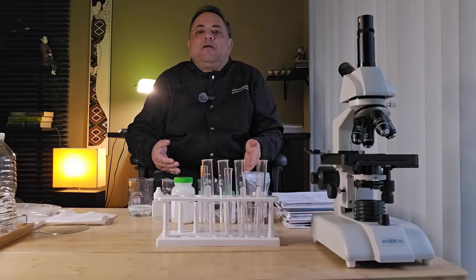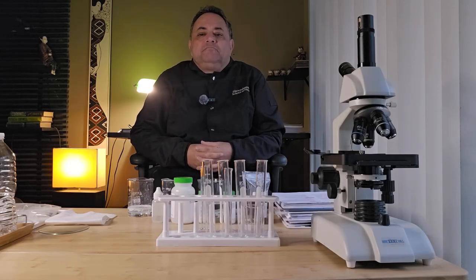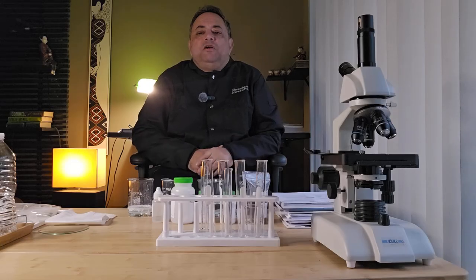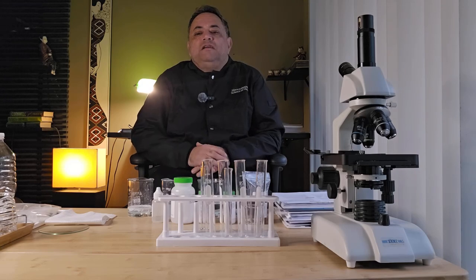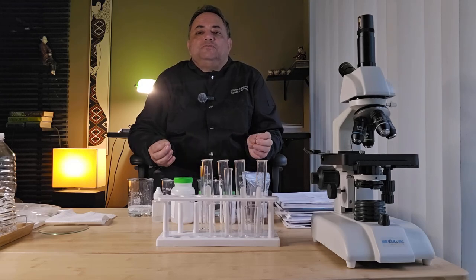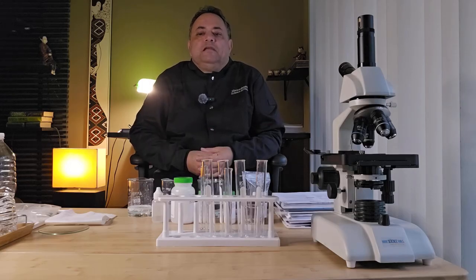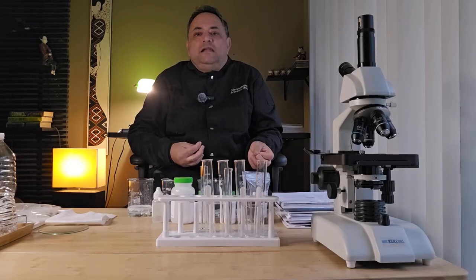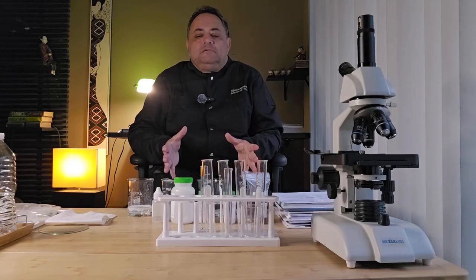And the example we're going to use is iron 3 oxide. We're going to make iron 3 oxide sol. This is a colloidal dispersion in which very fine particles of iron 3 oxide are dispersed in a liquid. It's a type of sol, which is a colloid with solid particles dispersed in a liquid medium.